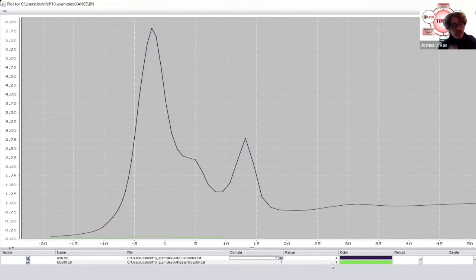The way this actually has the density of states in there, you've got energy in column 1, of the photoelectron relative to vacuum. And that's the same energy scale as column 2 in xmu.dat, but you can't really see the number there. But the next columns are S, then P, then D. So column 4 is actually D.